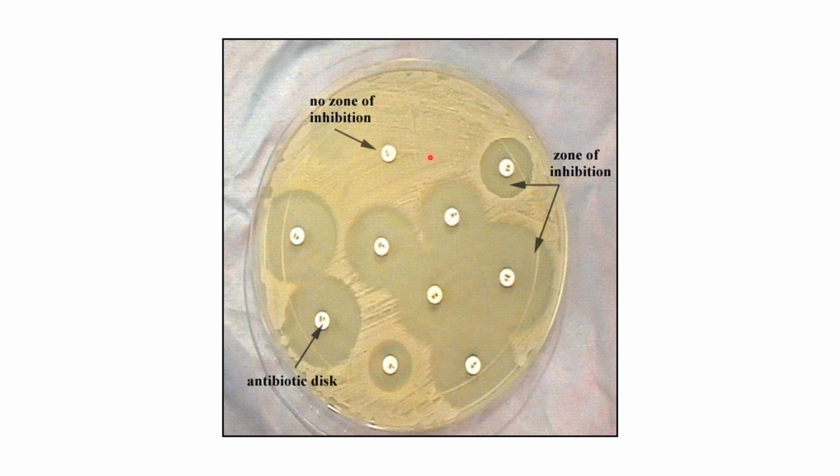And here you can see there is no zone of inhibition. That means this bacteria is resistant to this particular drug. Resistant means during incubation, the disc will contain antibiotic, and this antibiotic will diffuse into the media, but these drugs will not kill the bacteria. That is why we call it resistant.